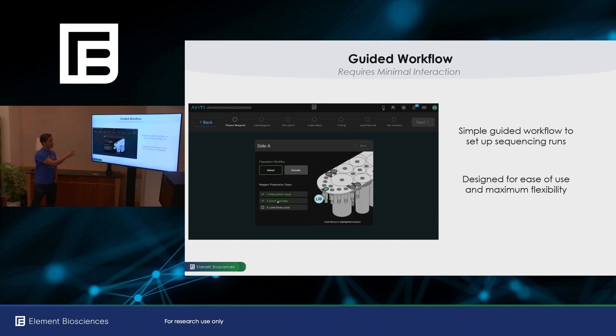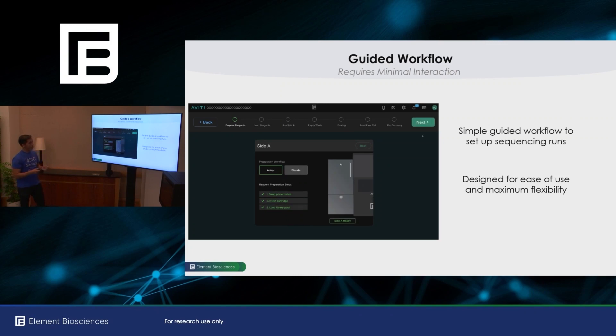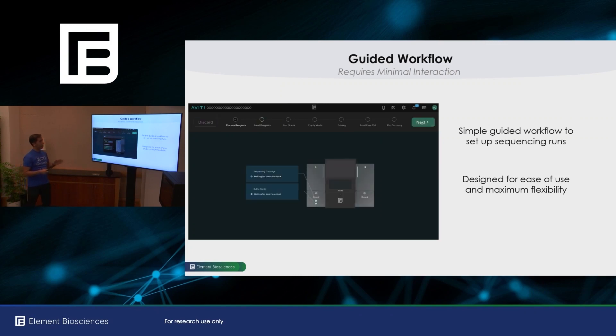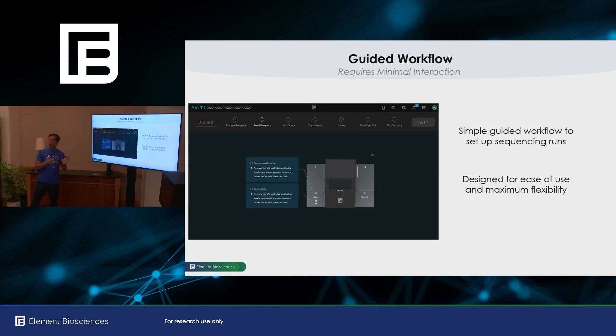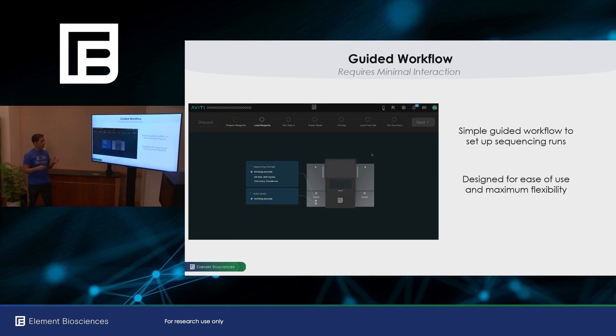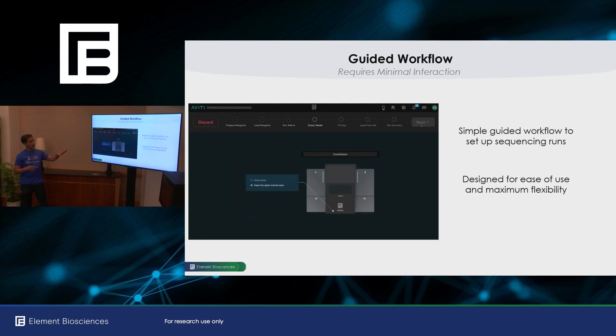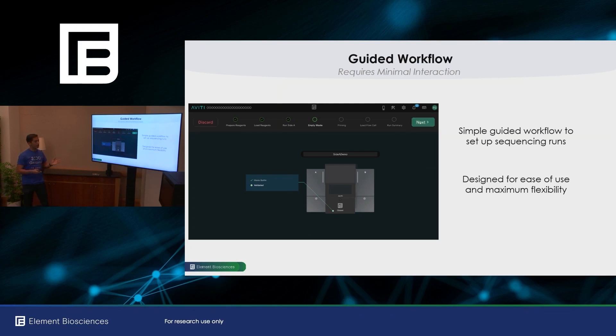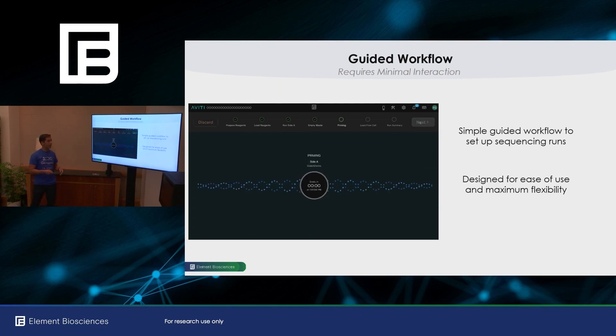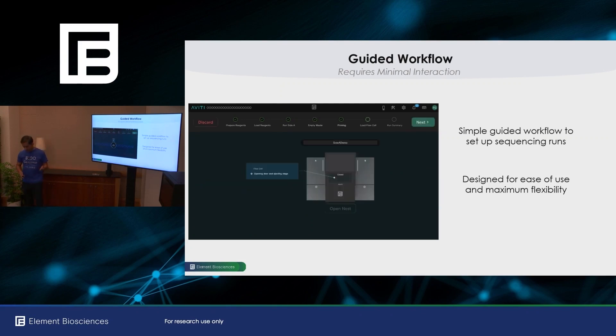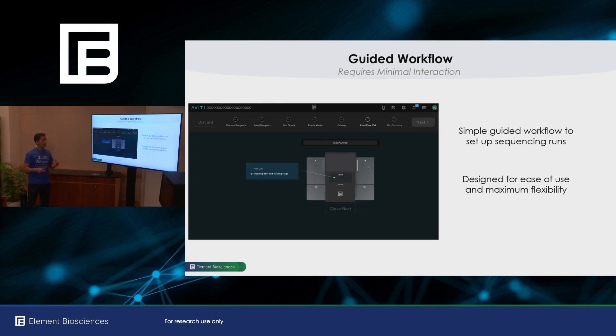So this is a new screen to tell you how you prepare your reagents before you load them. One of the differences now is that you load reagents before you set up your run information. This is because we have now different types of kits. We have different chemistry versions. We want to make sure that the information you put in your run matches the reagents you've loaded into the system. You empty your waste. You go through the priming of the fluidics.